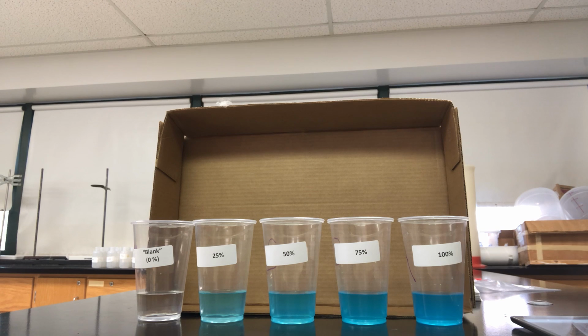It basically says that if you pass a light through a solution, some of it will be absorbed, some of it will be transmitted. If you analyze the light that comes through the solution and find out how much has been absorbed, you can, with a little bit of mathematical manipulation, determine the concentration of the solution just by the amount of light that's being transmitted or absorbed.